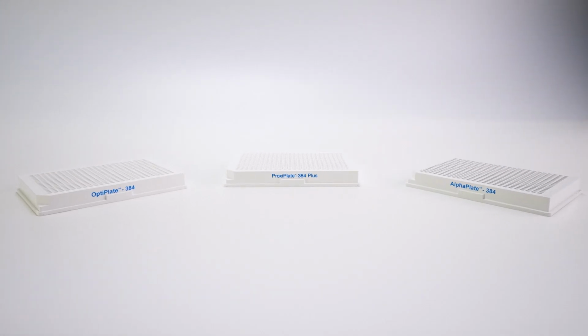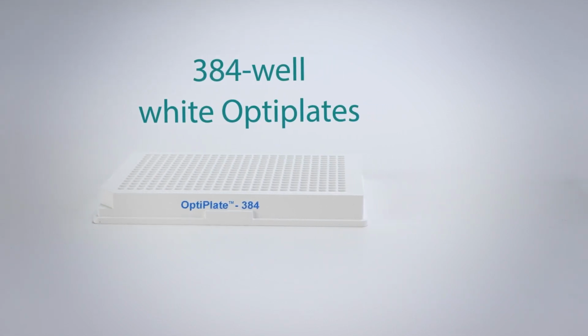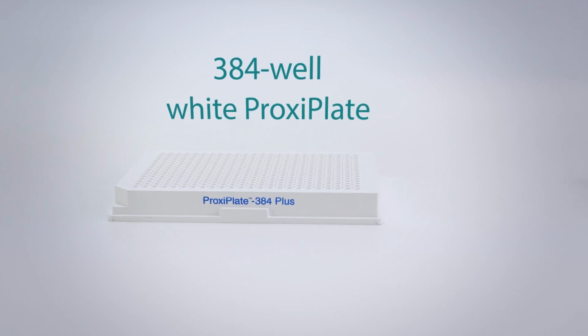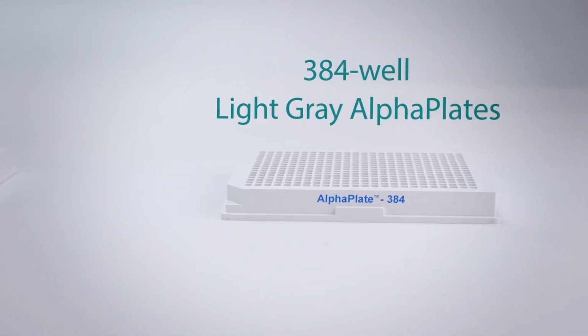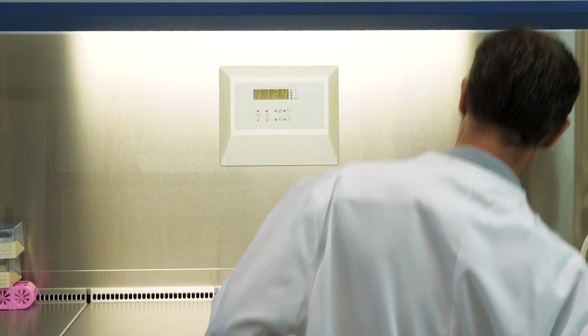Several plate types can be used for the immunoassay, depending on your needs. Revity 384-well white optiplates, the Revity 384-well white proxy plate, or the Revity 384-well light gray alpha plates that provide optimal alpha signals quality. Let's start your assay.